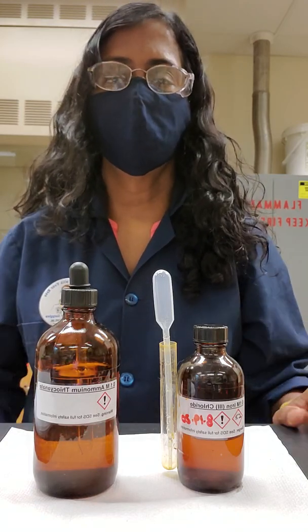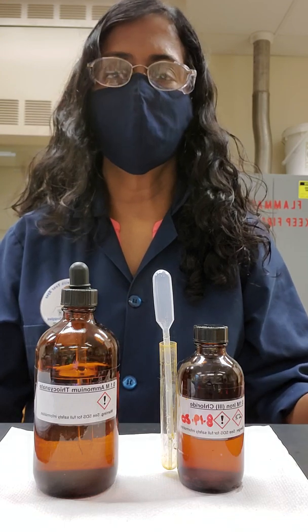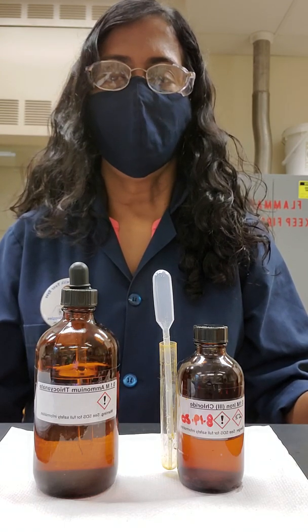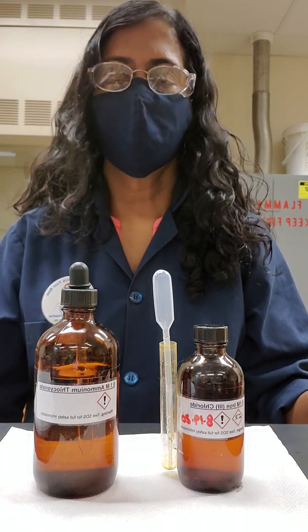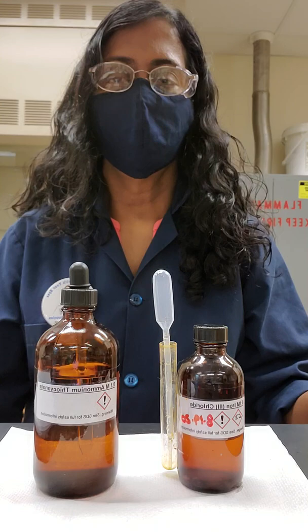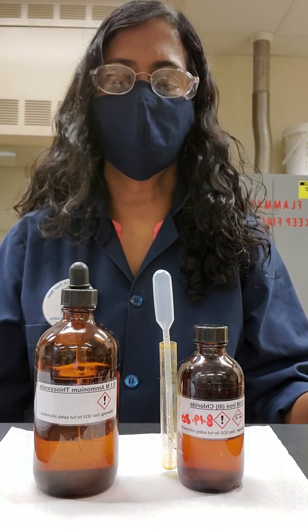We are in the chemical equilibrium lab this week, so we are going to study Le Chatelier's Principle. We are going to look at how stressors can affect reactions at equilibrium, and especially the changes in concentration effect will be studied in the experiment today.